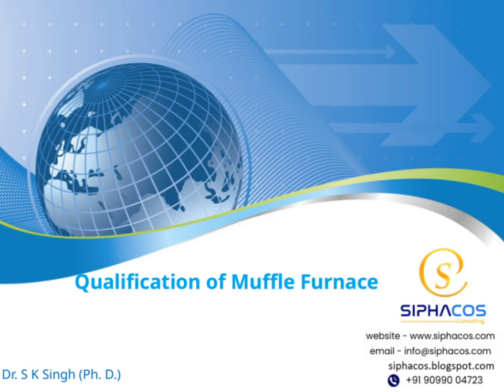I'm Dr. S.K. Singh, and I'm excited to share with you some insights on the qualification of muffle furnaces. Today's talk will cover the key aspects of muffle furnace qualifications, including their importance and application. We'll briefly look at the main features and standards to help you better understand this essential equipment. Let's get started.